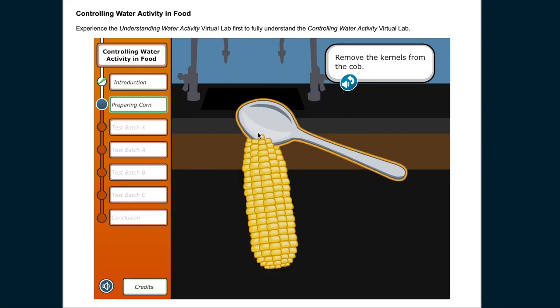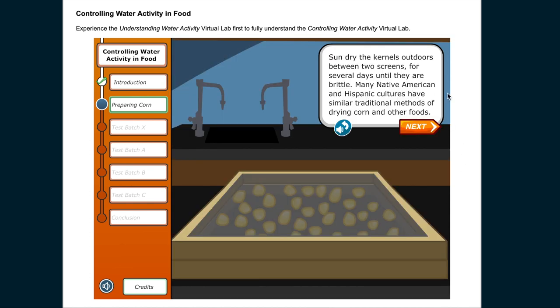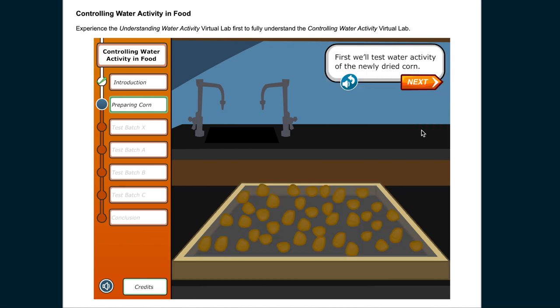Remove the kernels from the cob. Sun-dry the kernels outdoors between two screens for several days until they are brittle. Many Native American and Hispanic cultures have similar traditional methods of drying corn and other foods. First, we'll test water activity of the newly dried corn.